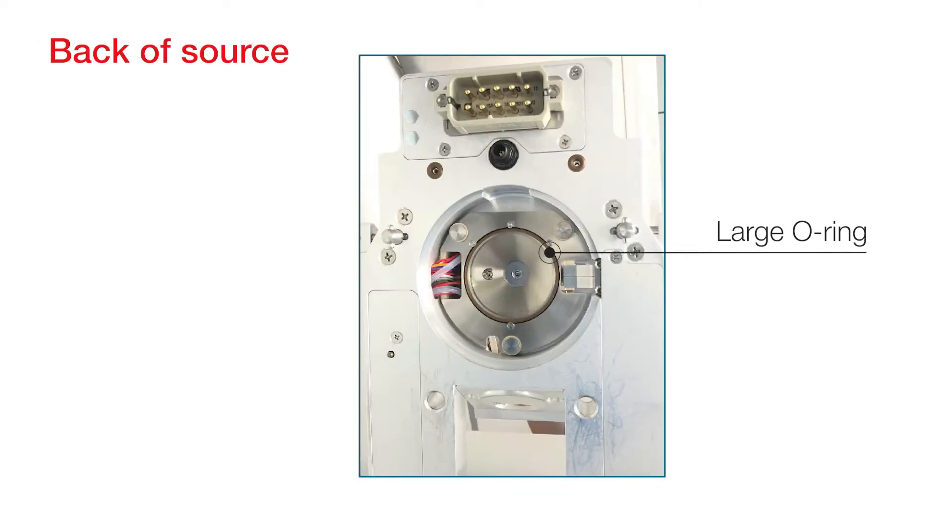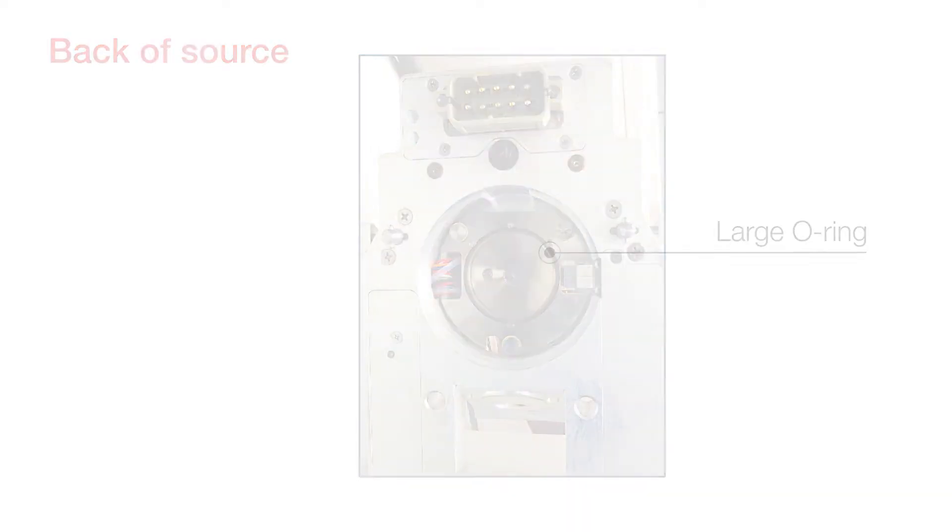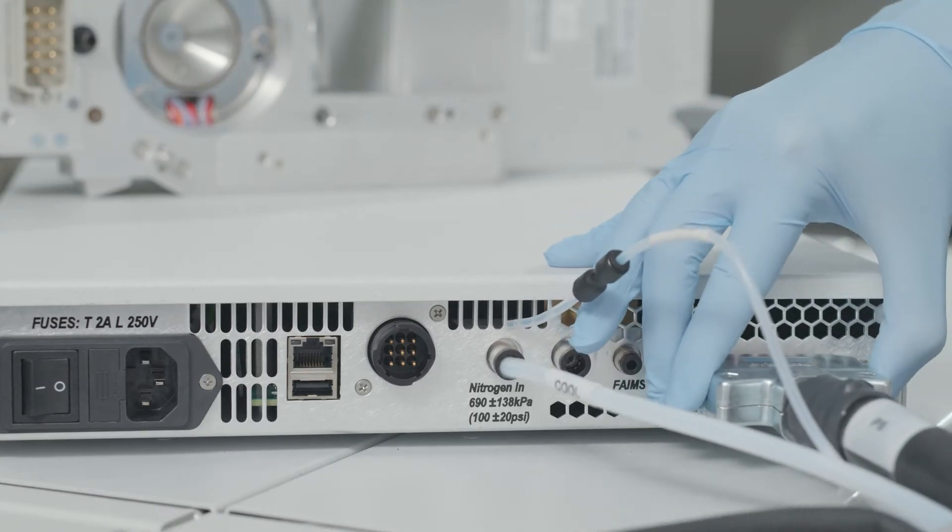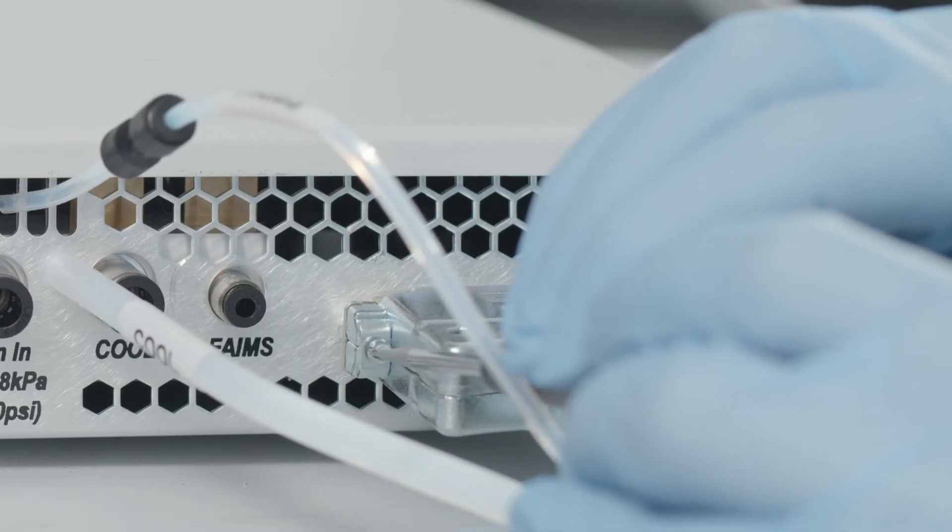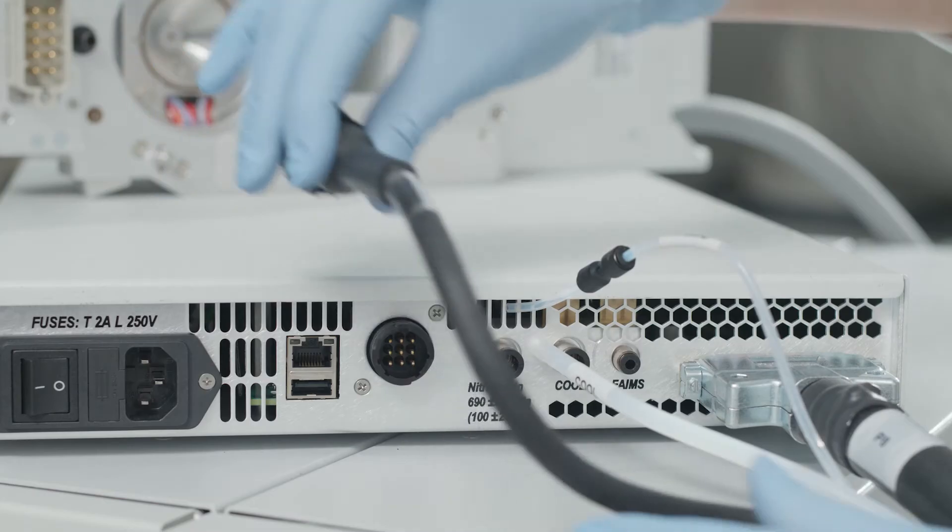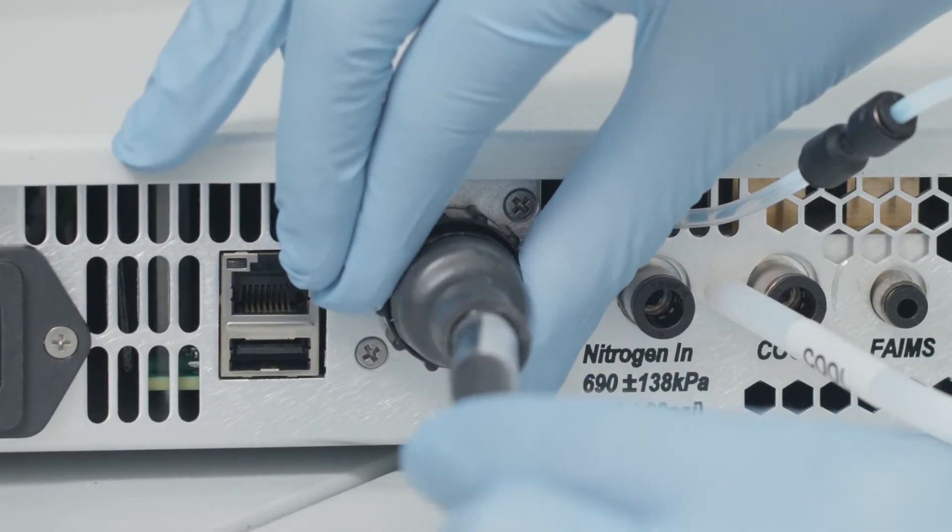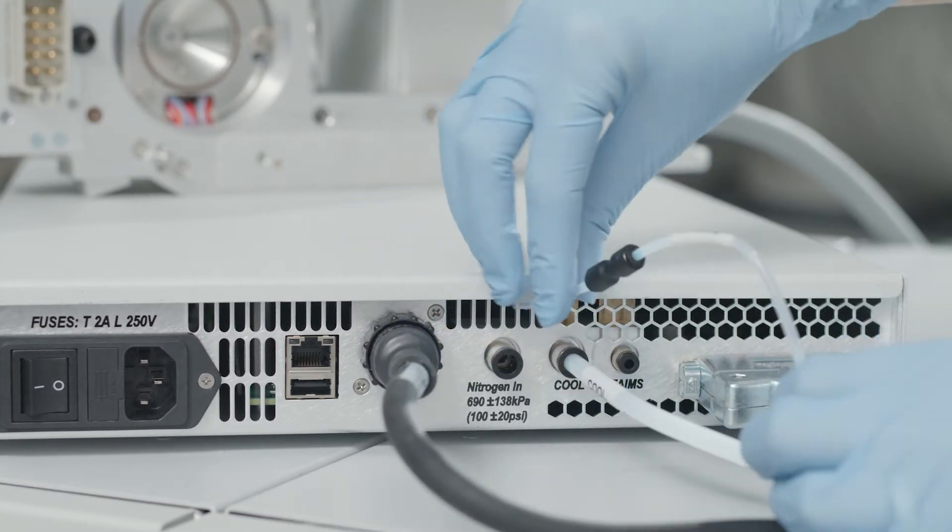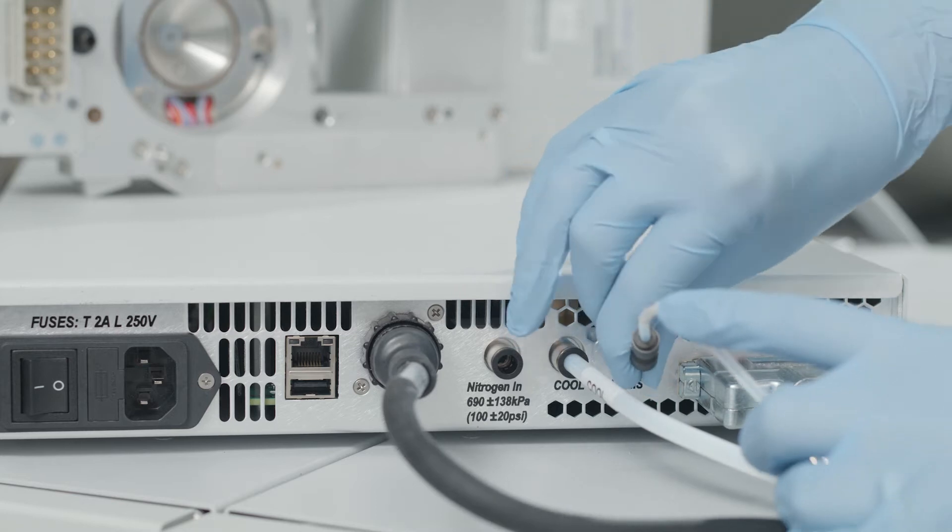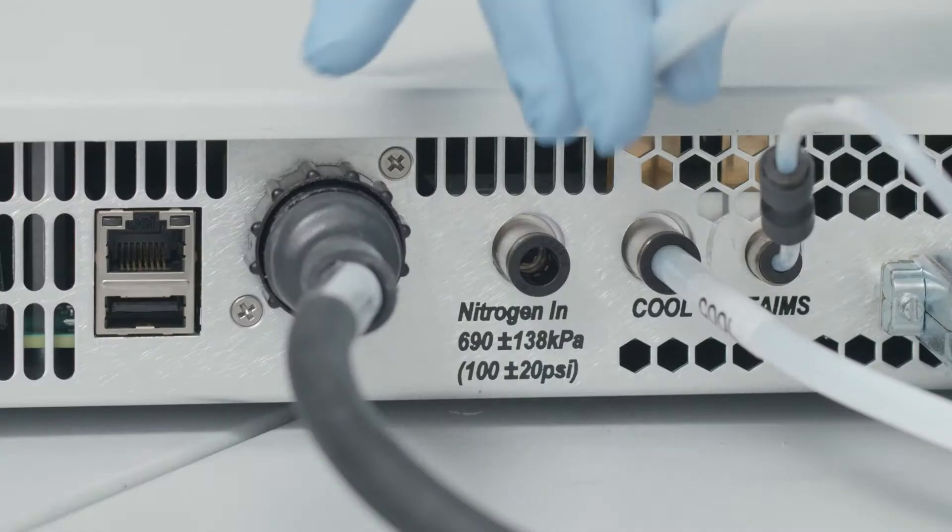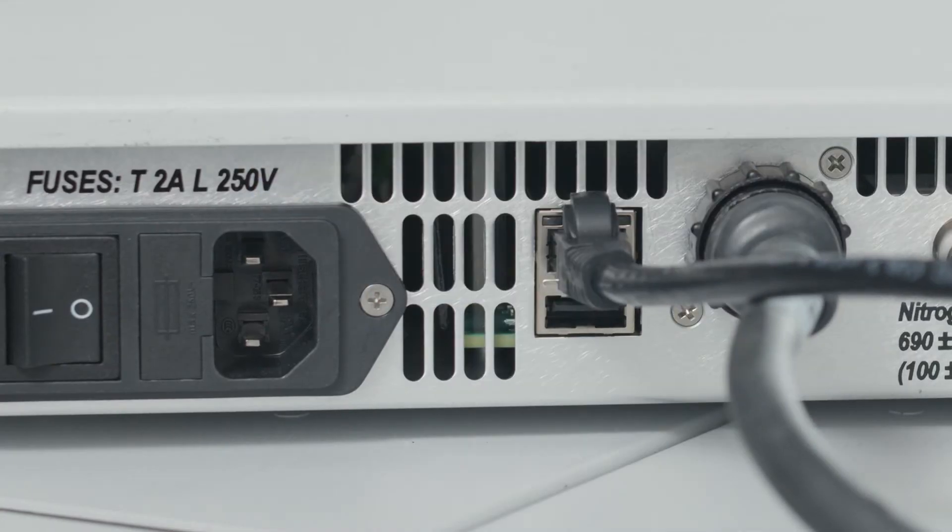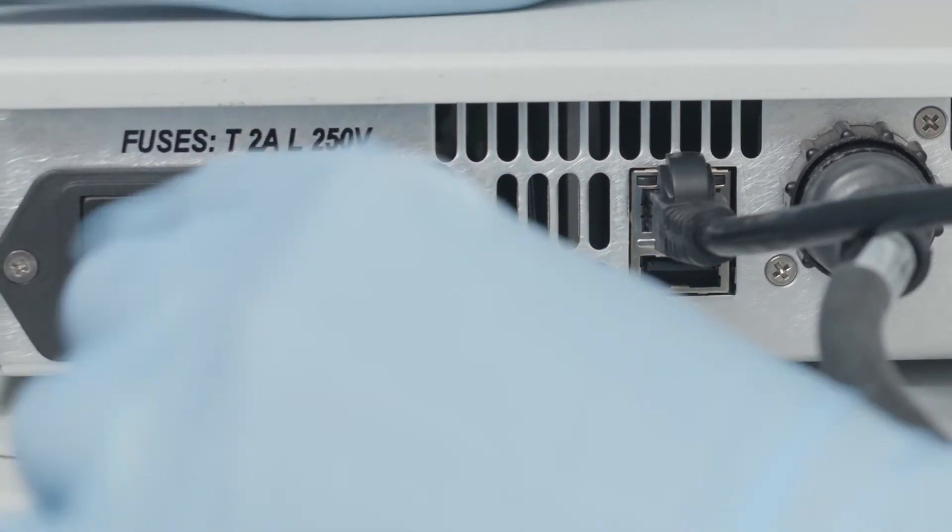Then check the placement of the large O-ring on the back of the FAIMS unit. Put the main control box, or MCB, on top of the instrument. Install the signal connector, high voltage connector, cooling gas line, FAIMS carrier gas line, nitrogen input line, ethernet connector, and power cable into the back of the main control box.